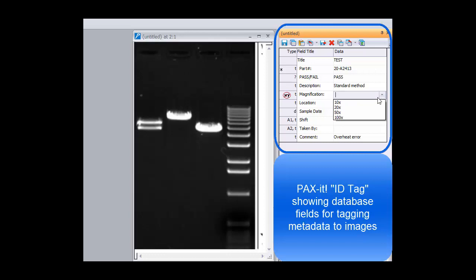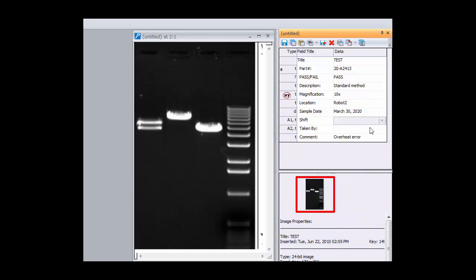You can set up how many fields to use, what they will be called, and how they will be structured. How that database layout is set up is the subject of this video.